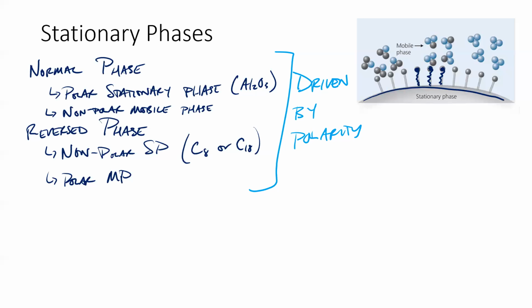And so silica gel is a pretty polar stationary phase, and it's also a pretty common one to put in if you're doing a hand-packed kind of column. Because a lot of times in organic synthesis, we're synthesizing things that don't dissolve very well in water. And so we're going to separate them out with a non-polar mobile phase so that they dissolve, and then separate them out based on what little polarity they do have. Okay.